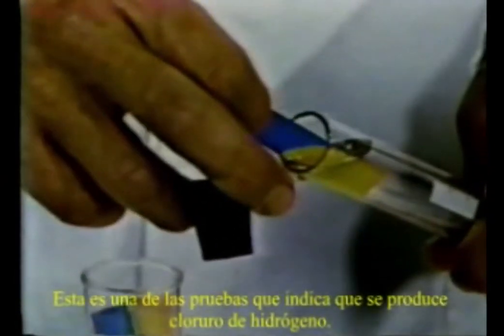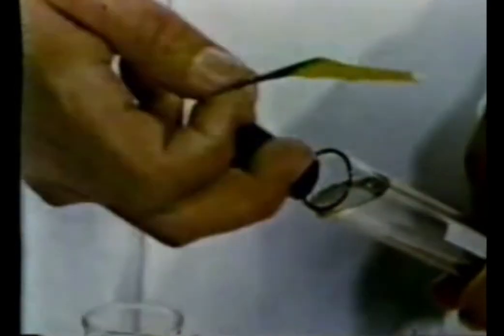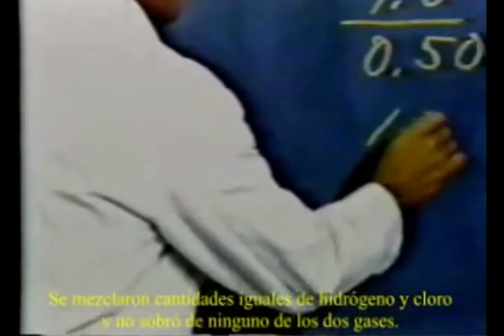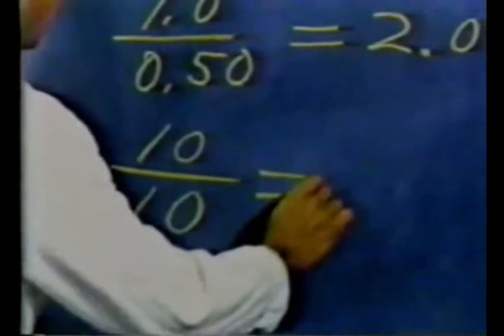We can spark the mixture as we did earlier. The water rose, almost filling the tube. The combination of hydrogen and chlorine gives a substance that dissolves in water. This is one of the tests that show that hydrogen chloride is produced. But our interest lies in the volume ratio. We mixed equal volumes of hydrogen and chlorine. There was no excess of either. The volume ratio is 1.0.